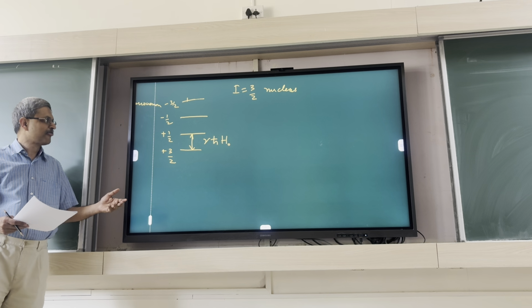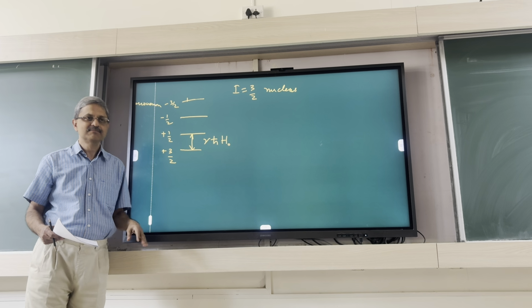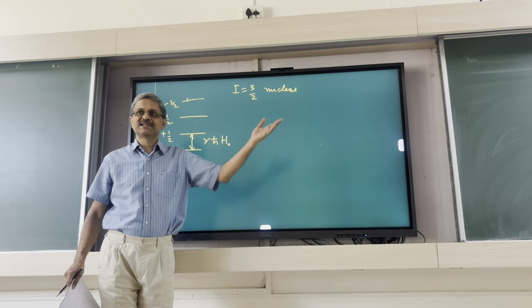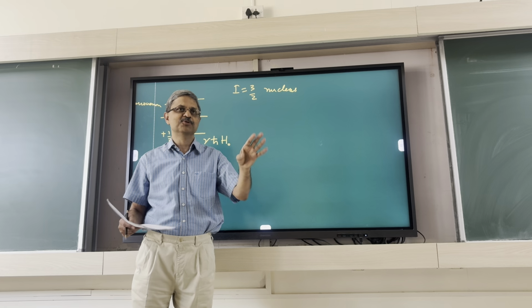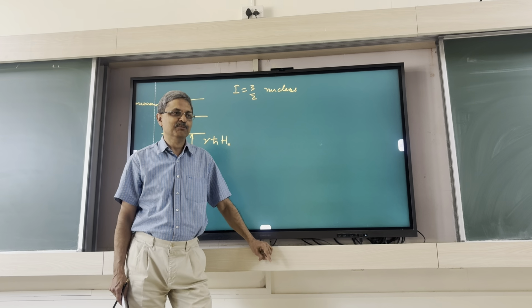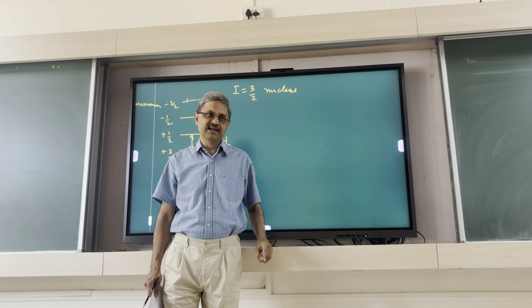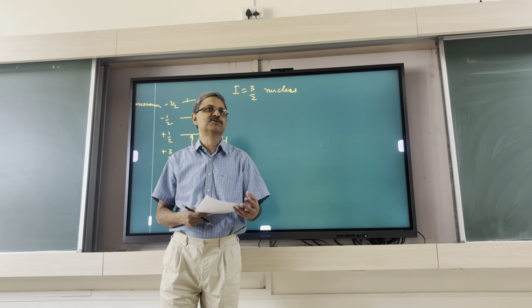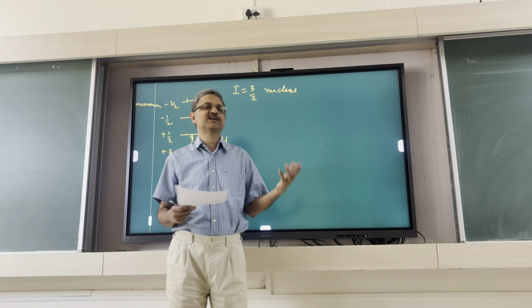In practice, can one apply a field of just 100 Gauss and get a resonance? So we're digressing a bit, but in a lab scale like this, usually you need fields of Tesla or more. But remember, in principle, it's also done in practice. You can design electronics and probes where you do very fine measurements, even in small fields. I mean, it's just an in-principle issue, right?